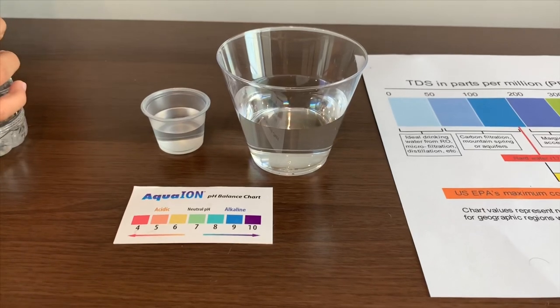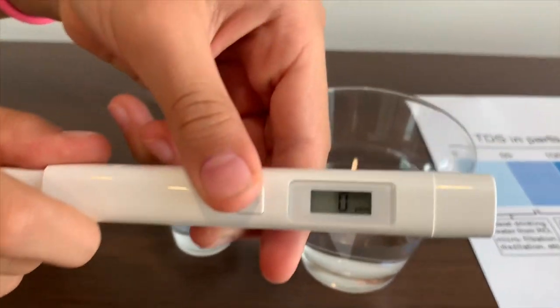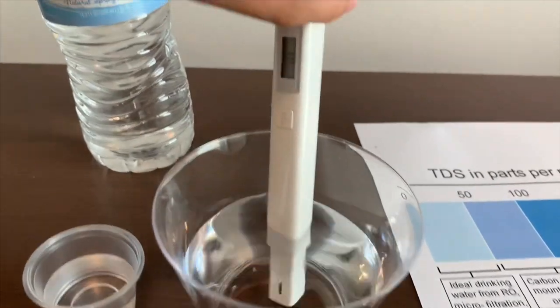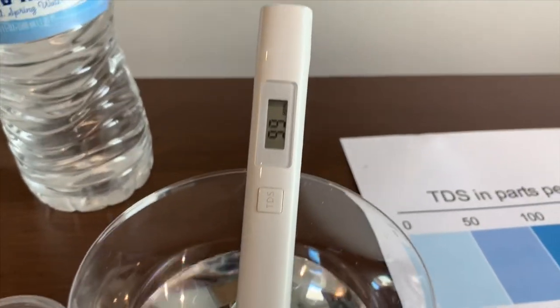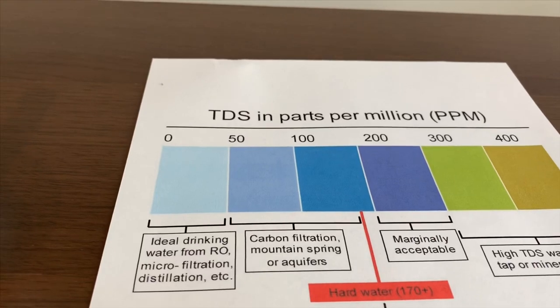Let's test the TDS level first. Turn on the TDS tester and put it in. The reading is 100. That is an okay level.